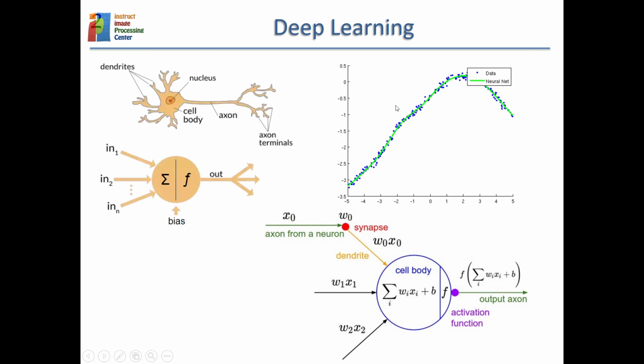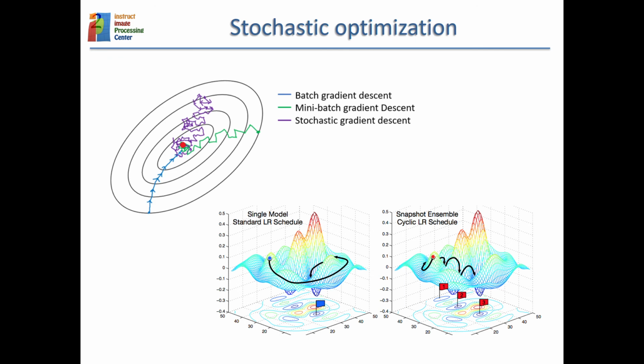So if you are familiar with regression, in a regression of a line, for instance, you have the parameters of the line. So you need to find those parameters, and that is where all this stochastic optimization has been really improved a lot, and it allowed for finding the parameters of your model in a safe way. So stochastic optimization is different from deterministic optimization in this way.